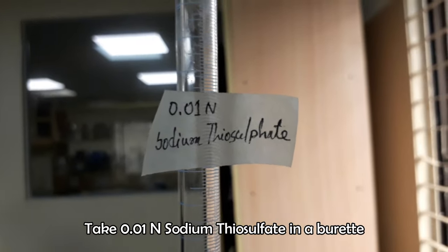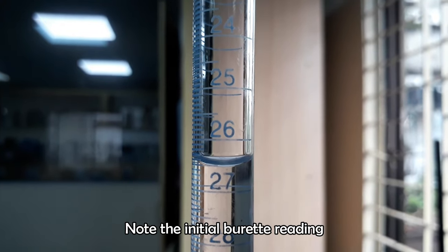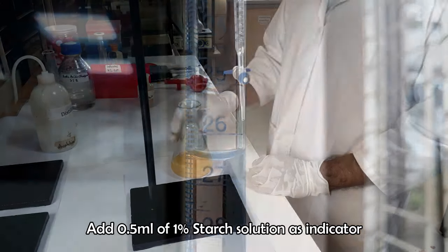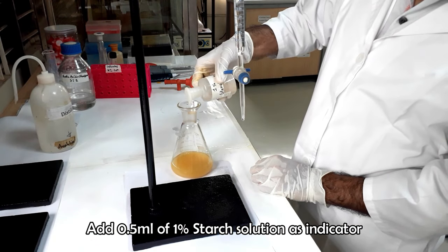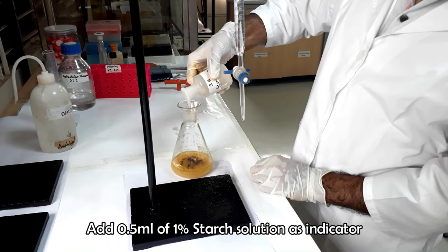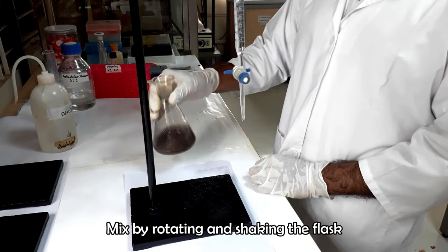Take 0.01 normal sodium thiosulfate in a burette. Take the initial burette reading. Start titration after adding 0.5 ml of 1% starch solution.